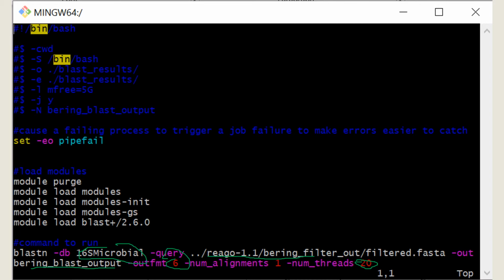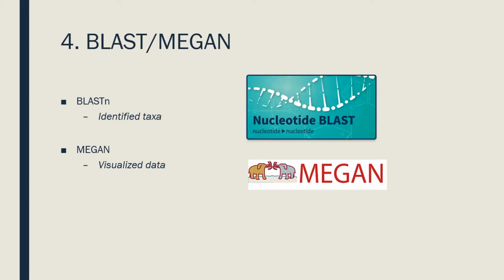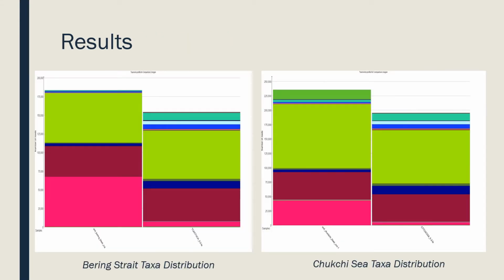The file was then opened in MEGAN, a microbiome analysis tool, where taxa names were assigned based on this number. MEGAN was then used to interactively visualize the data with phylogenetic trees and bar plots at the class level. Following this analysis, a STAMP file and a metadata mapping file were both exported and loaded into STAMP, a program which performs statistical analysis on the datasets.